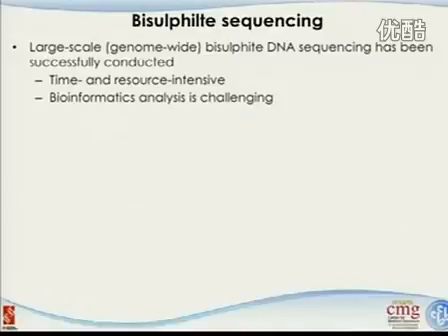But after you do the bisulfite treatment, you are not dealing with something that has 4 letters anymore, because some of the C has been converted to U, some of the C are not, right? And when you do the alignment, how are you going to do it? It will be really, really hard. And it's not even a 3-letter genome. It's a 3.5-letter genome, right?